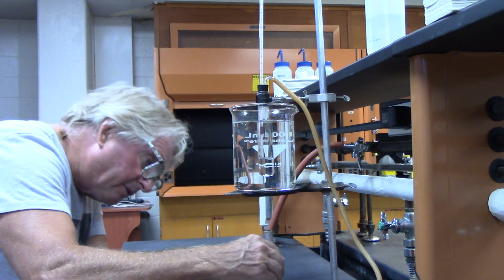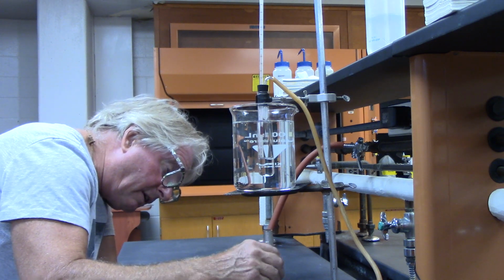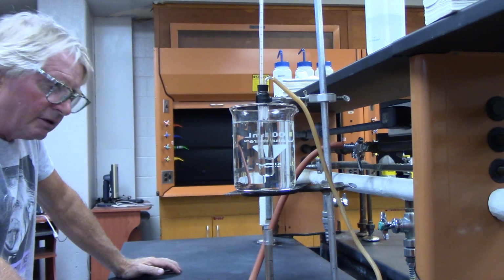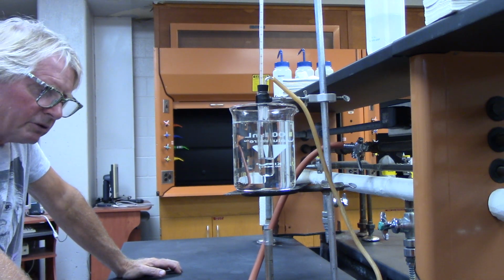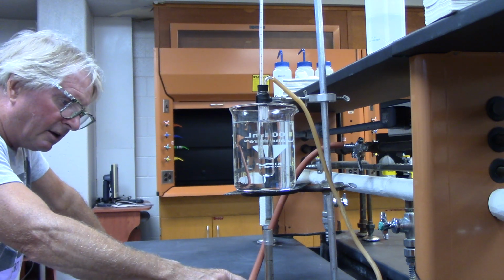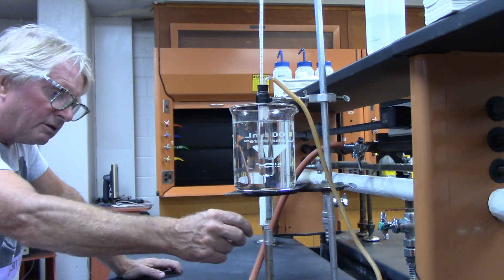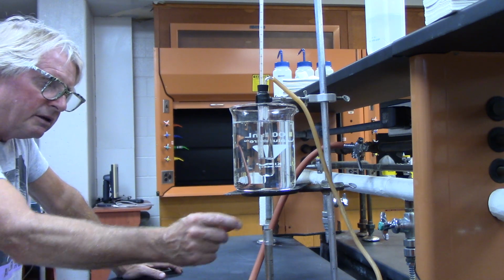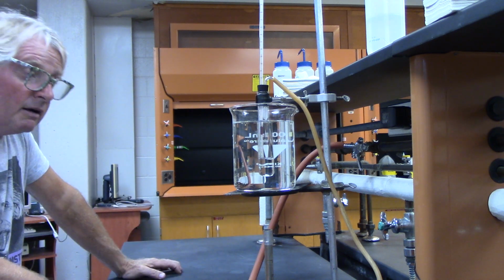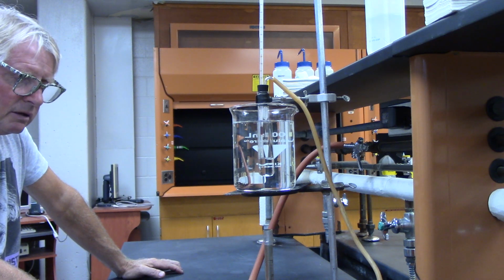This is a combustion reaction, which will be on test number 2. We're essentially combusting methane, CH4. The methane and oxygen combine in that little valve, we light it, and they combust and form carbon dioxide, water, and heat.